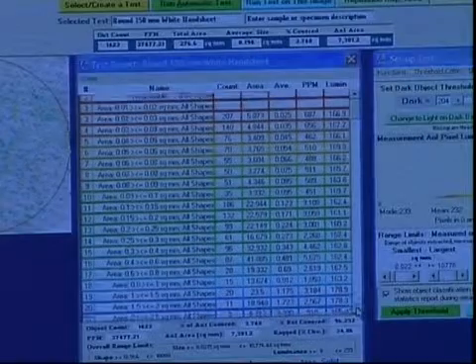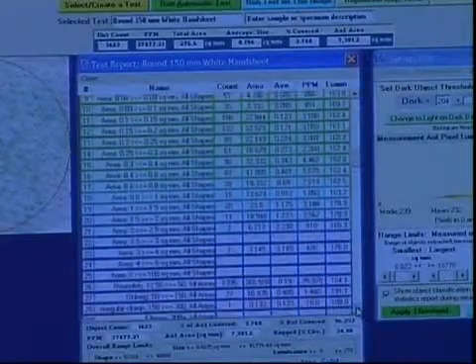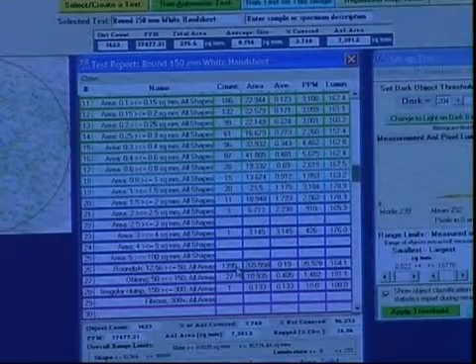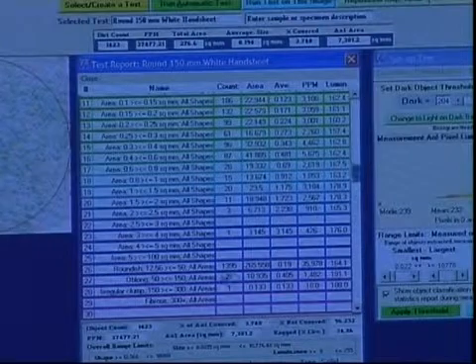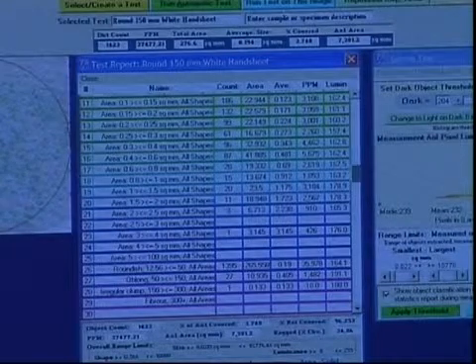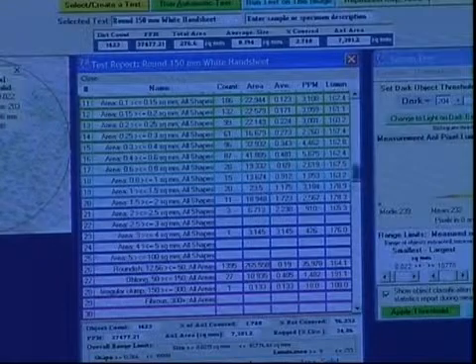All of these specs in the image are color-coded according to the classification. At the bottom, you see that we have reclassified, and we have all the roundish specs, there are 1,300, and we have some long, oblong shapes at 27 and one of them. Down below, we have the statistics, and we can, in fact, find the smallest object by clicking on it, and it found it up there.